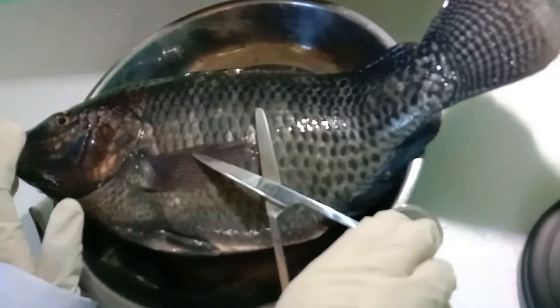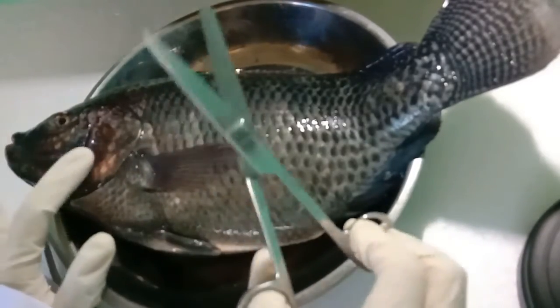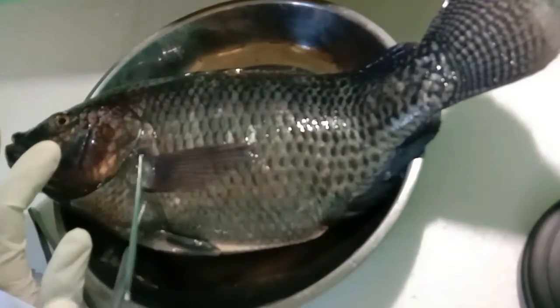The next discussion is about the muscular system. To see the muscles more clearly, I will cut the fish like this.